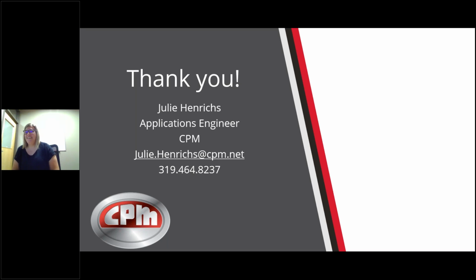Julie, you can go to this, or maybe you can decide if you want to reach out afterwards on this, but the question is, what is the theoretical equation of calculating mean particle size? Oh boy. We use a spreadsheet, as do many other people, where we use a series of logarithms and natural logs, and it's all percentage based. We can share a spreadsheet with you that would better explain those equations in more detail.